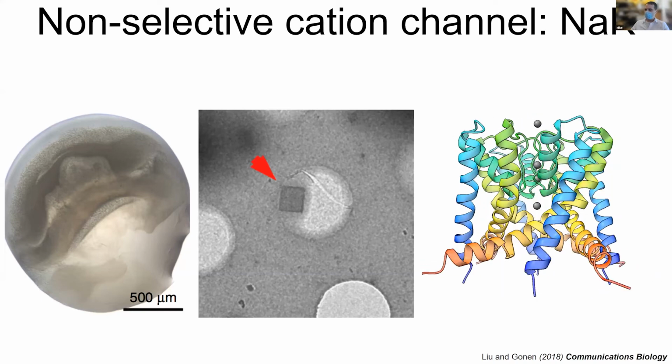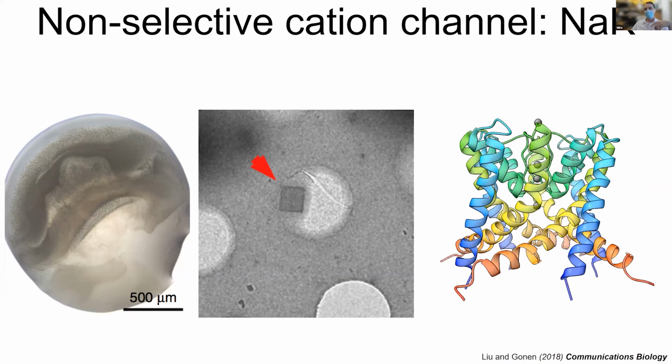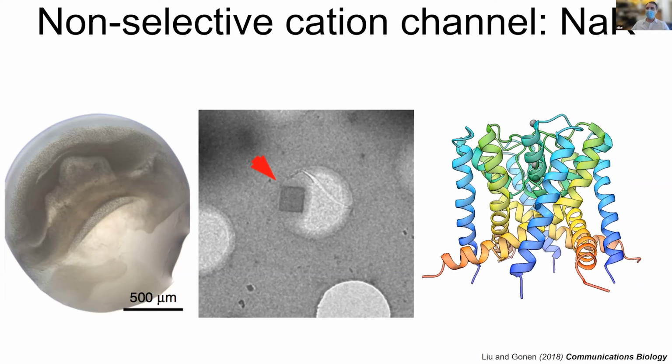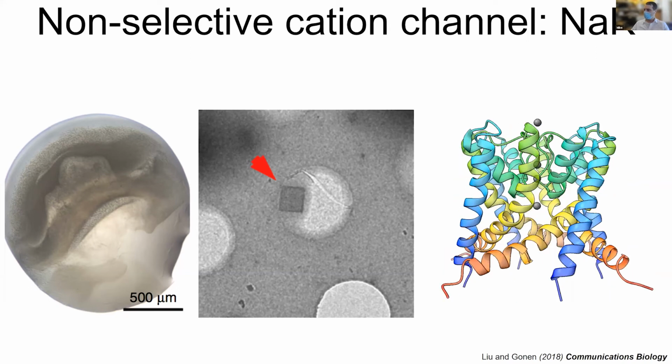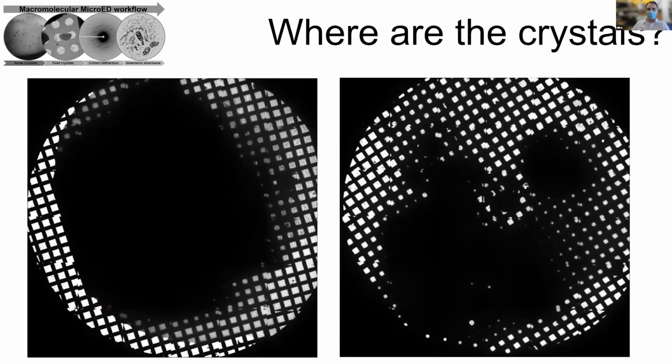But the problem was, there's a whole bunch of crystals where you can't just go in and blot, or you can't sonicate, you'll destroy them. In these cases, we would just gently blot the grids and put them in the TEM, and almost always they would look like this. With that one on the right there is the thing of nightmares. And we spent a lot of time looking around the thinner areas of these crystals or grids, trying to find crystalline edges and things. But this is a horribly inefficient way of trying to find these tiny crystals.